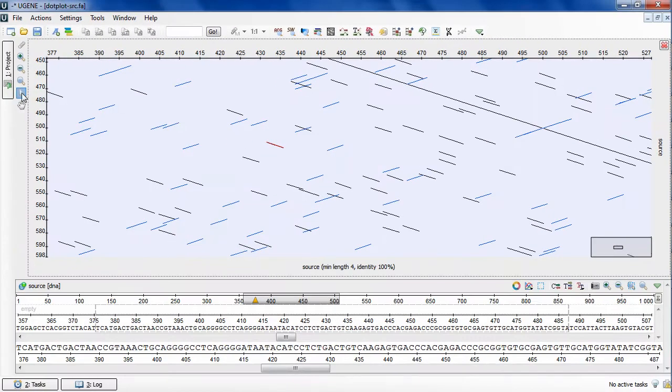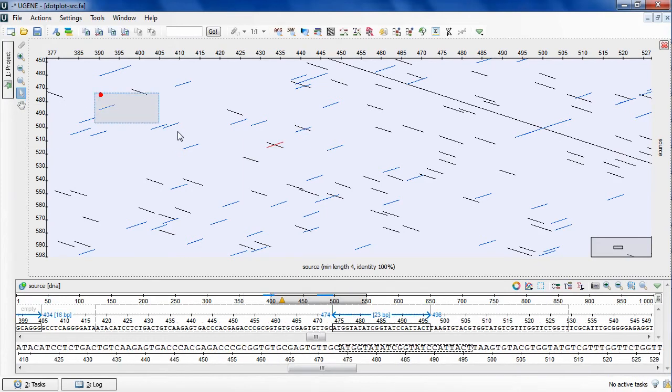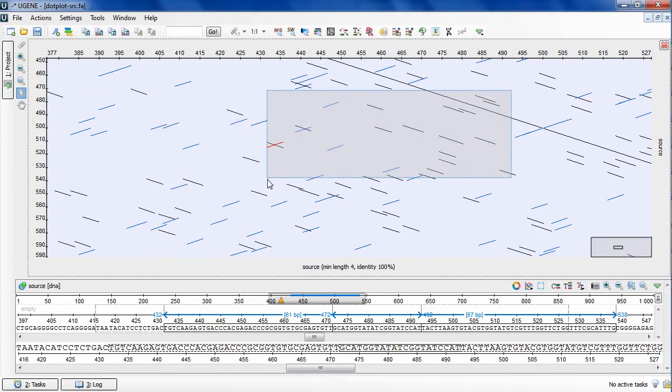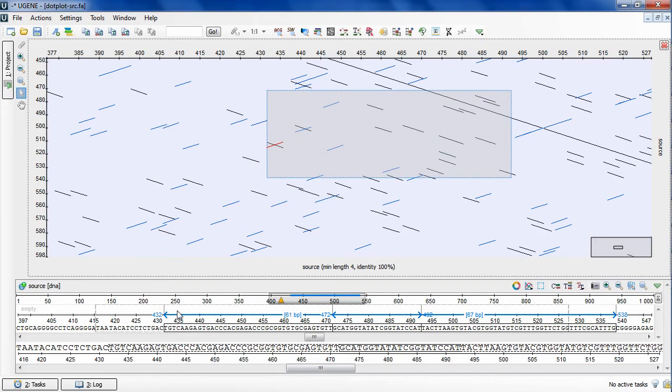Selection tool. In this mode, you can make selections on the plot by dragging the mouse cursor. The corresponding selections will automatically appear on the sequence's views.